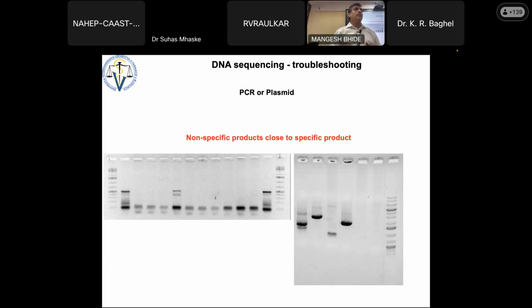That result might be a non-specific result, because you are going to add whole genome in the PCR reaction, and whatever is going to amplify, and whatever is this and this, and you may get these results as well, and you may not get these results. Okay, so always send your sample, cut yourself by yourself, and then send it. Cutting takes 1 minute, purification takes 10 minutes. That's it.